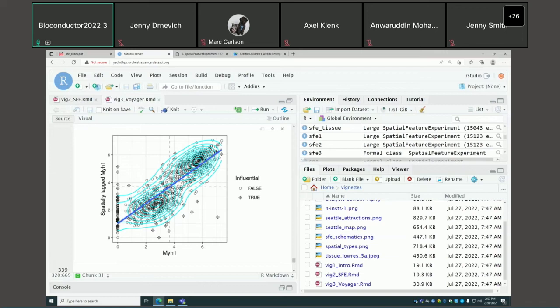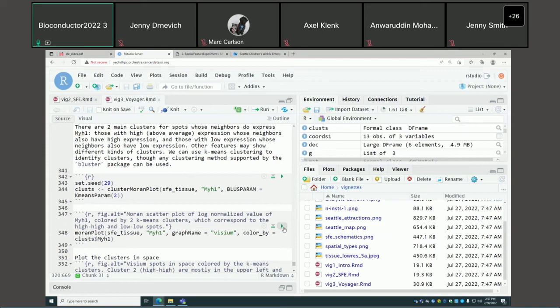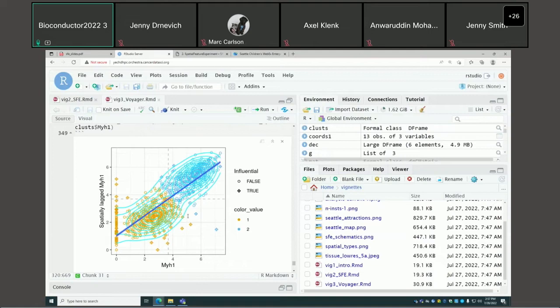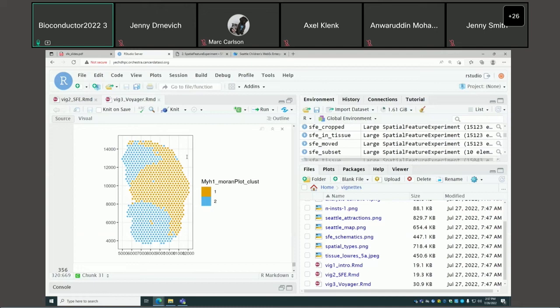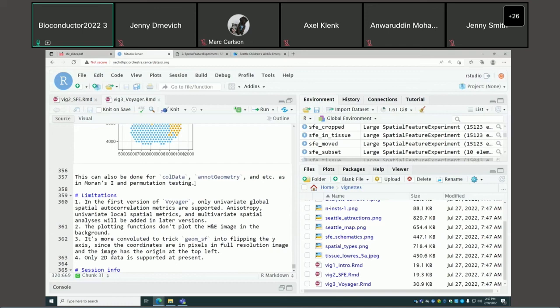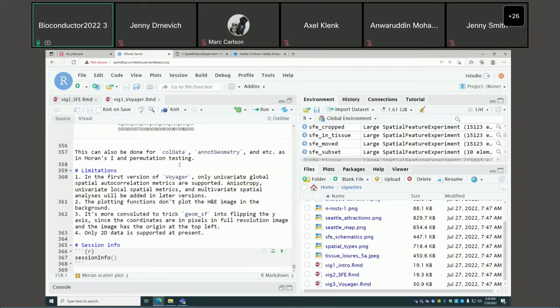Sometimes we see clusters in this kind of Moran scatter plot, which can be more interesting to investigate. We can identify those clusters using the bluster package on Bioconductor and plot them on the Moran scatter plot and in space, to identify different spatial regions with different kinds of neighbors in terms of gene expression values.